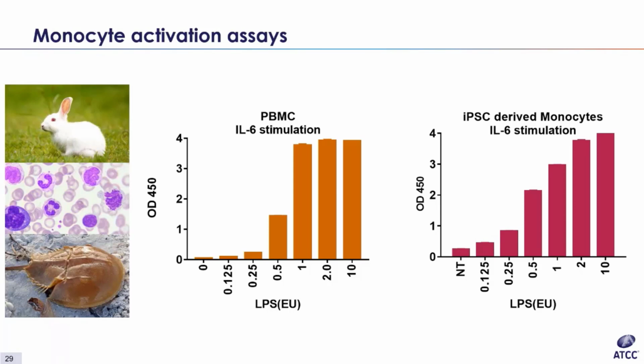Now, historically, there have been 3 tests that have been used to determine the safety of these parenterals. The rabbit test is the first one I'll talk about. It involves subjecting rabbits to the biologic or parenteral and then monitoring them for fever or death. Bad for the rabbit.